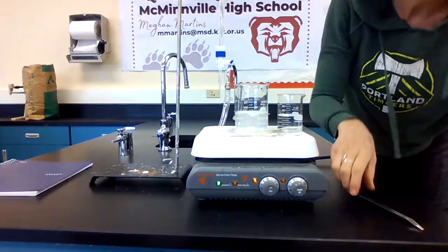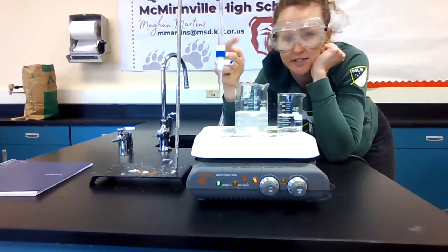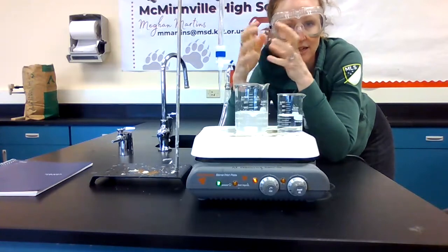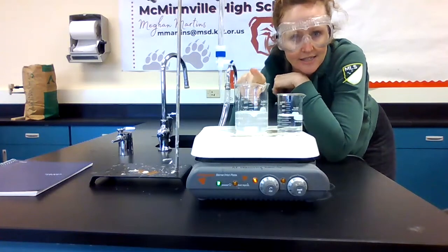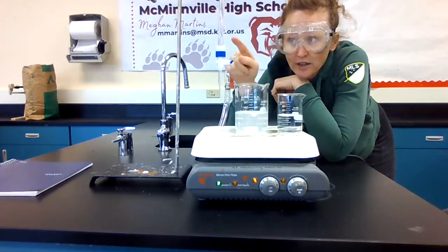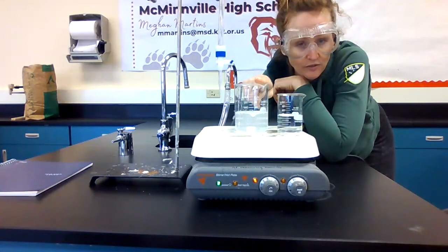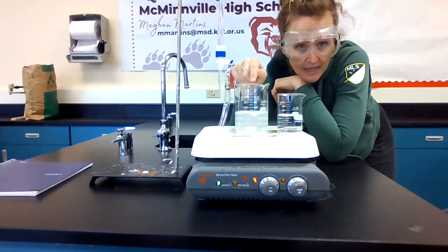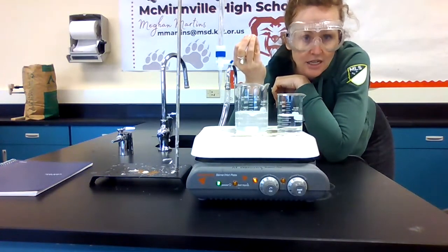Right now we have acid, and we're going to start to add base. As we add base, it's going to react with the acid and turn it into water and salt. So as our reaction goes on, we're going to get less and less acid in here. Eventually we'll have added so much base that we have neutralized all of our acid. At this point, our phenolphthalein is still going to be clear, but one more drop of base has no more acid to react with.